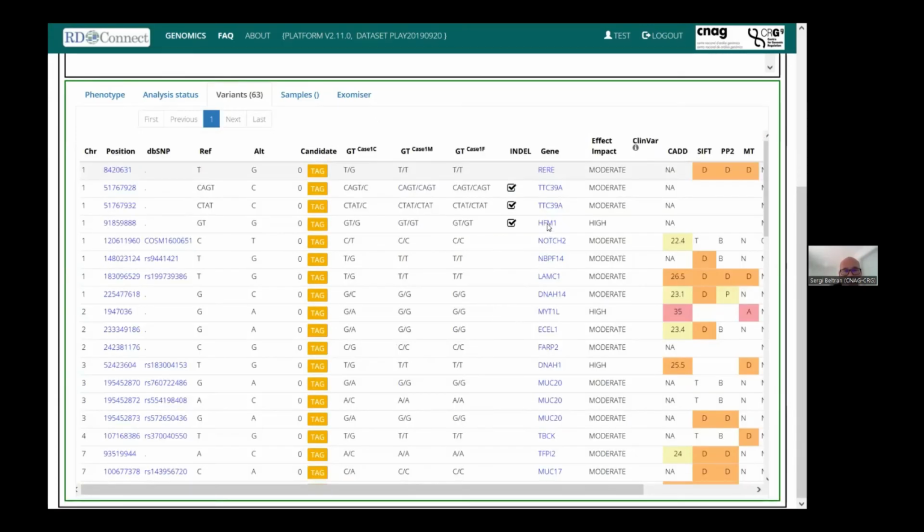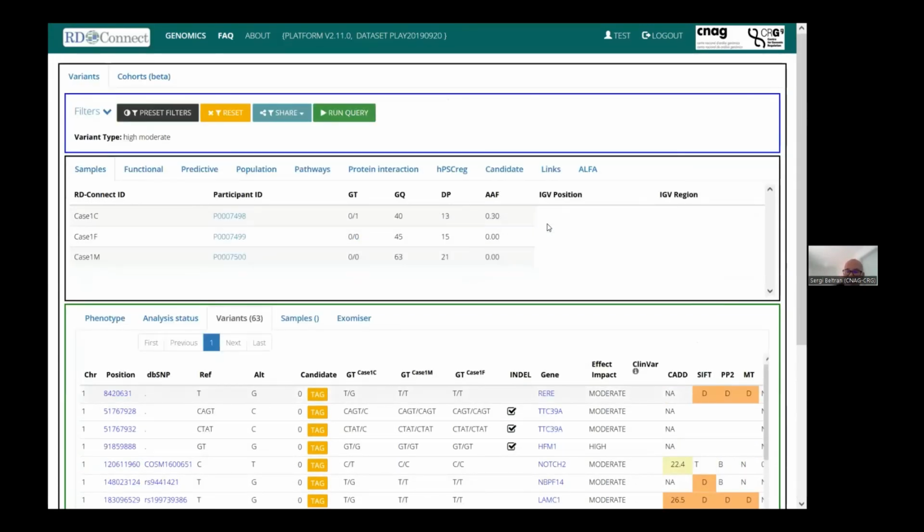And now we already went down to 63 variants. So we have reduced the number of positions a lot, because there are very few effects that might be deleterious. And remember that here we're looking at alternate positions, and maybe some of them only have an effect if they are in a homozygous state.